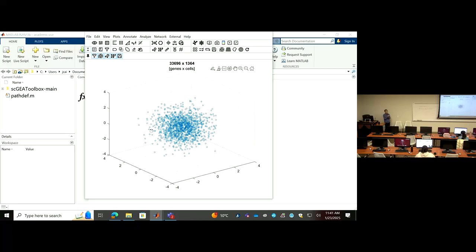From the filter, embedding, cluster, and annotation, and save. That's all. Okay? So you can click through these 5 buttons and finish off the annotation to save the results onto the hard drive here. Then we are done today. Okay?